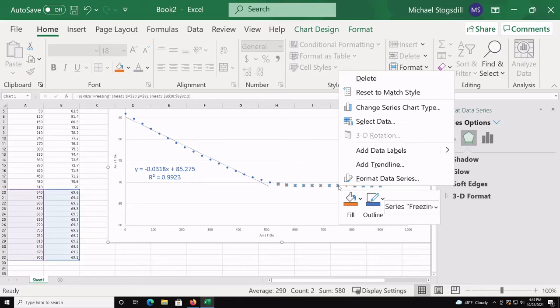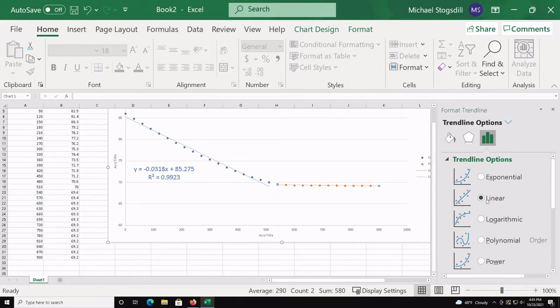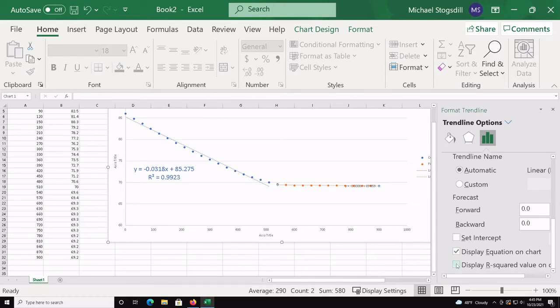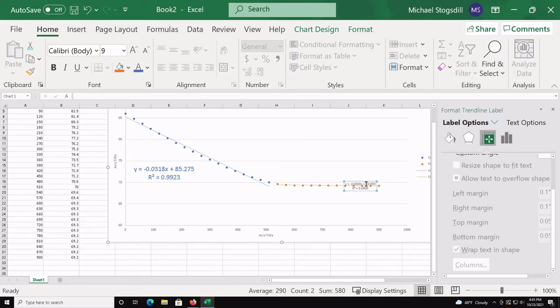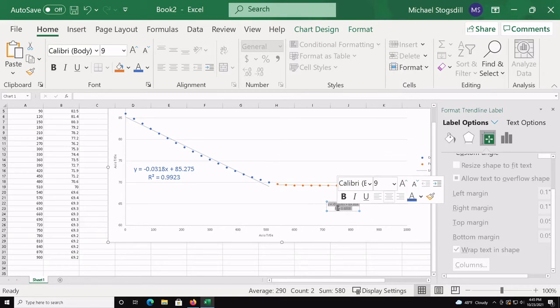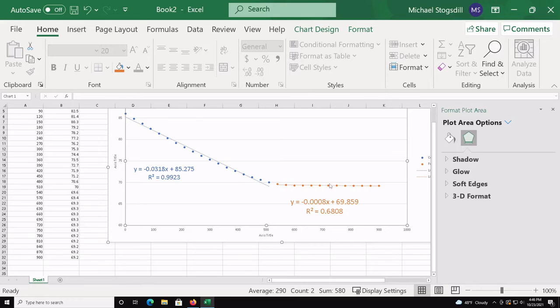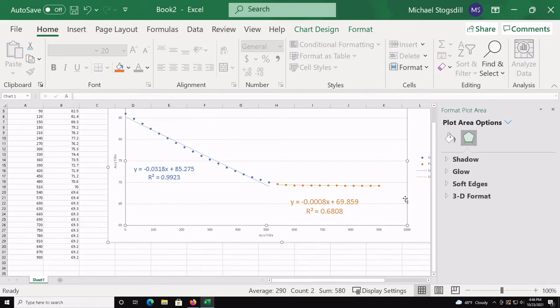Do the same for the freezing series: click on it, add a linear trendline, display the equation and R-squared value, drag the label to a sensible position, make it large, and color it orange to match that series. Now we have two equations on the chart. The lines will visually intersect somewhere around 500 seconds, which is a nice sanity check before we move forward.